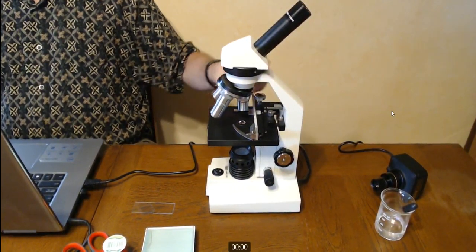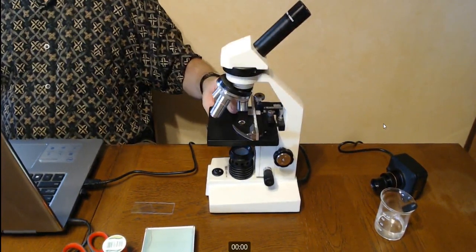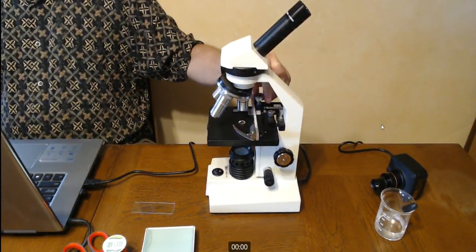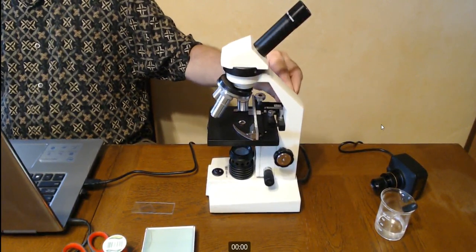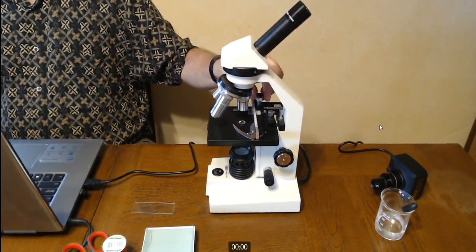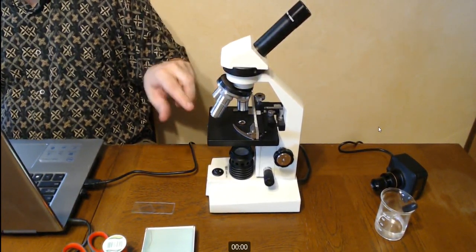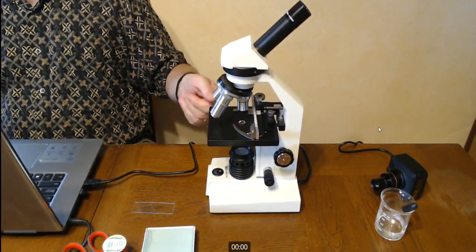A couple of things on the stage. One, we have a slide holder, a mechanical slide holder. It allows us to put our slide in, and we've got knobs on the side that move it up and down and back and forth. That can be very useful. Some microscopes don't have that. They just have clips there, and you have to use your thumbs to move it around as you go.